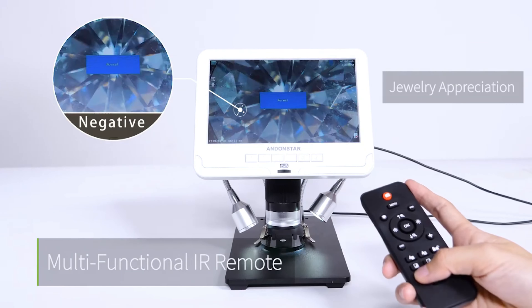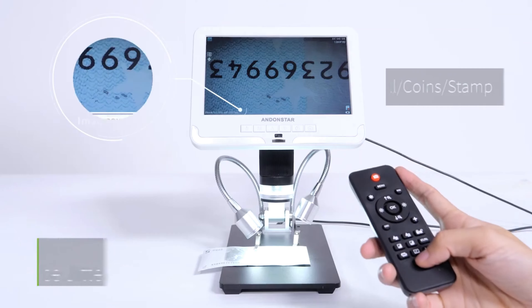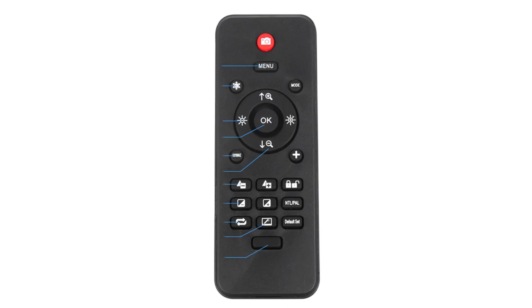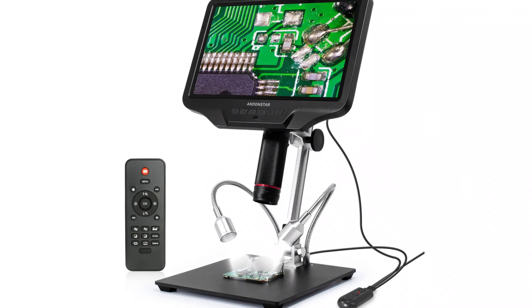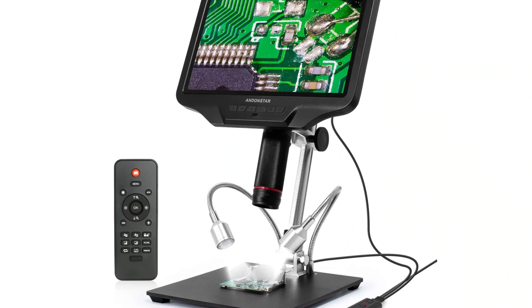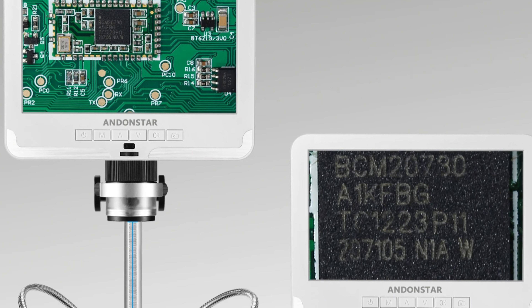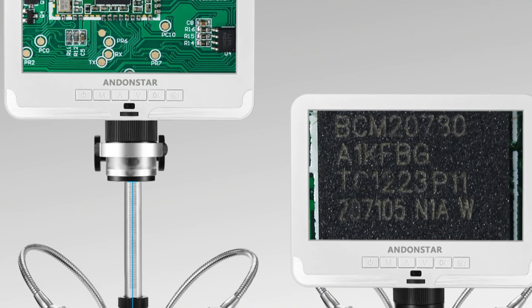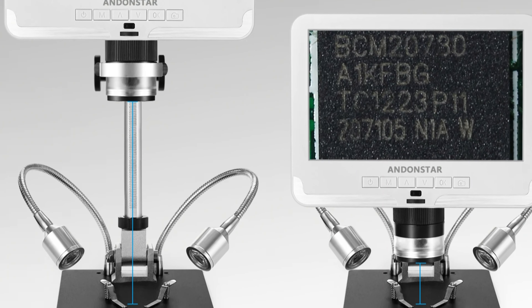Number 3: Andonstar AD407 HDMI Microscope. The Andonstar AD407 HDMI microscope is a portable, high-definition microscope designed for scientific exploration. It offers magnification ratios ranging from 500x to 1500x, allowing for detailed examination of biological samples and electronics. The AD407 is portable, making it easy to take anywhere your curiosity takes you, including classrooms, laboratories, and fields.